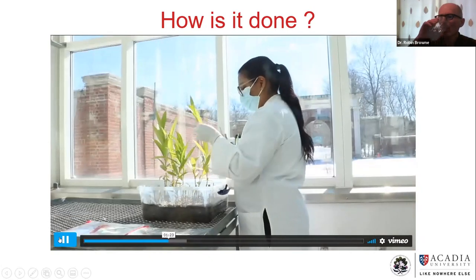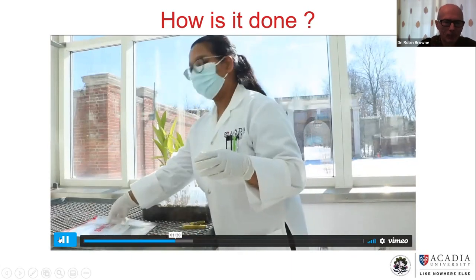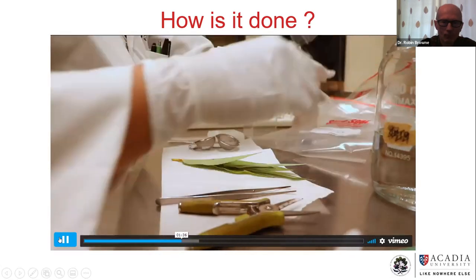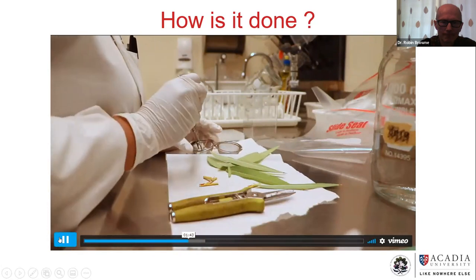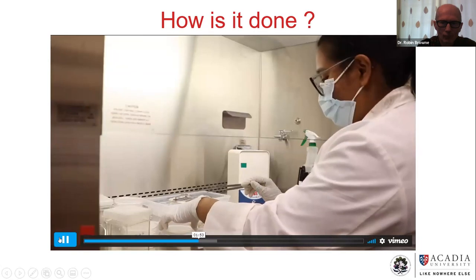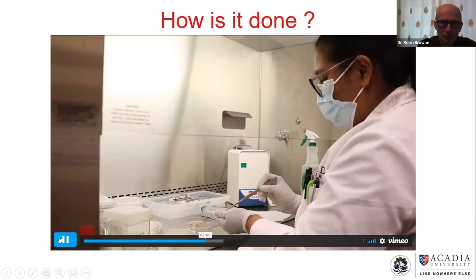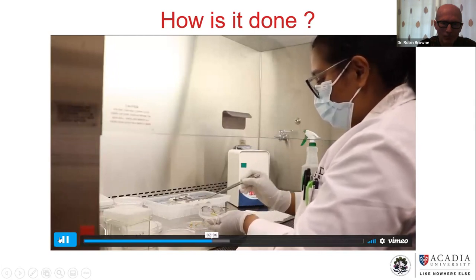The first step in the culturing process is generally referred to as the initiation stage. Samples are collected from source material in the greenhouse or field. In this case, we are collecting shoots from willows grown in a controlled greenhouse environment. They are placed in labeled bags and taken to the tissue culture lab for processing. Samples are cut into sections and placed in containers for surface sterilization. Typically, the containers are placed in a series of detergent, alcohol, and bleach treatments to clean the samples. Next step is to trim the samples further to provide explants, as we call them, and place the explants on an initiation culture medium. This medium contains an antimicrobial agent to help control any contamination which may overgrow the explants.